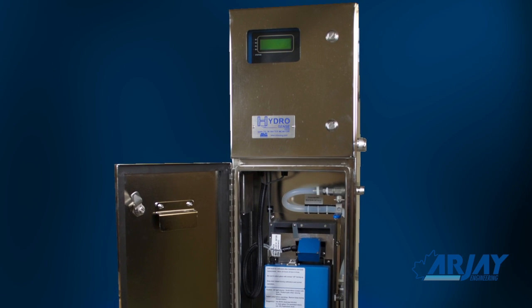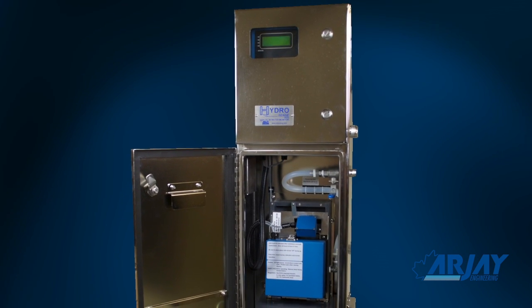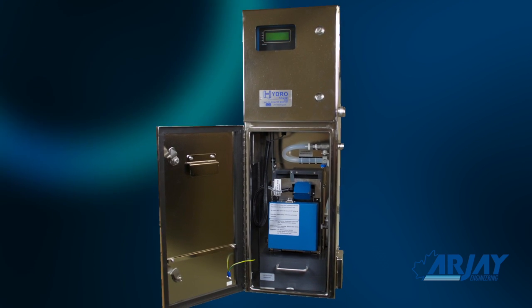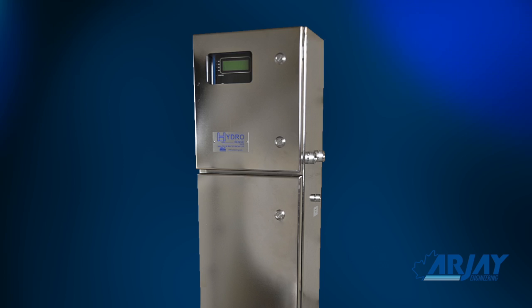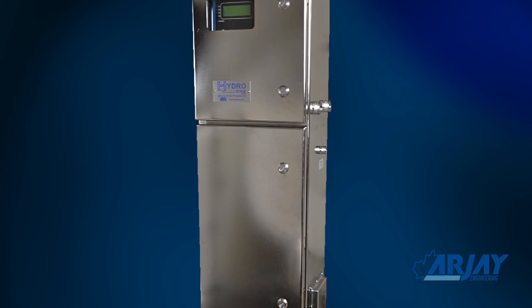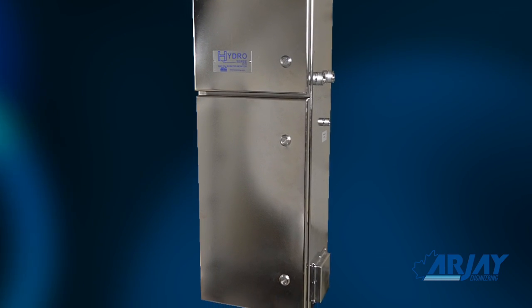The HydroSense 2410 is designed for high accuracy PPM measurement of your process and stream conditions. To accomplish this, an initial site setup and calibration will be required. Remember, the instrument will be taking readings of your sample 50 times every second, 24 hours a day, every day of the year.